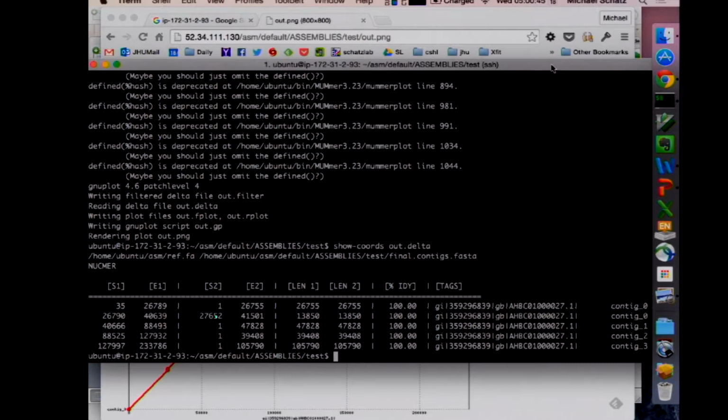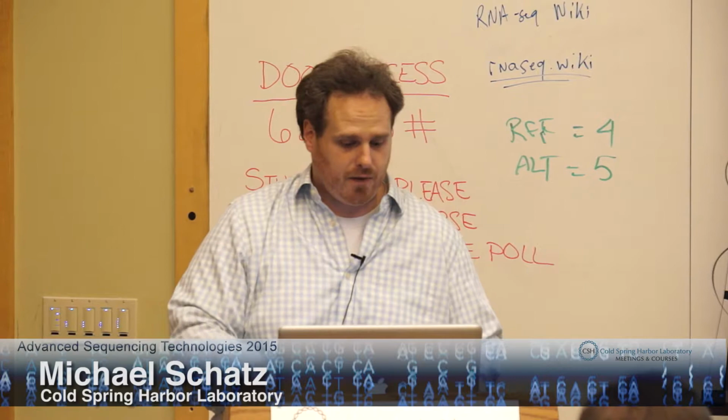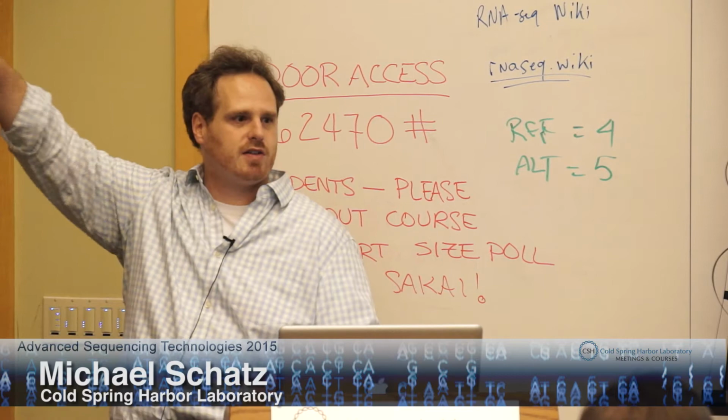So that's the good stuff. We want to go in and try to figure out what's inside of there. This could be, I don't know, where the tumor virus inserted itself into the genome. Let's go check out what that is. The way that we're going to pull that sequence out is using SAMTools. SAMTools is a very flexible program. It has a lot of modes of operation, one of which is to pull out just arbitrary segments. You can ask for whatever you want.